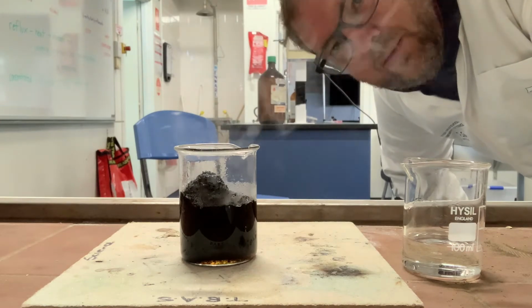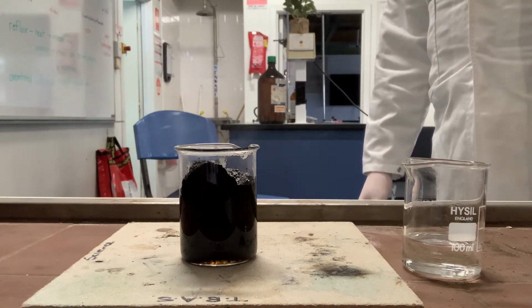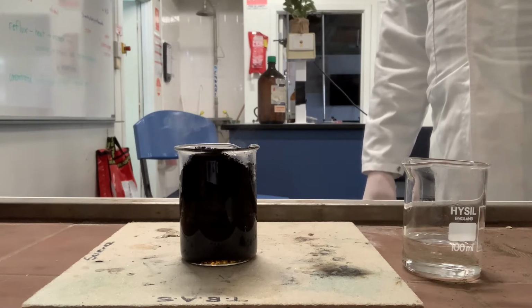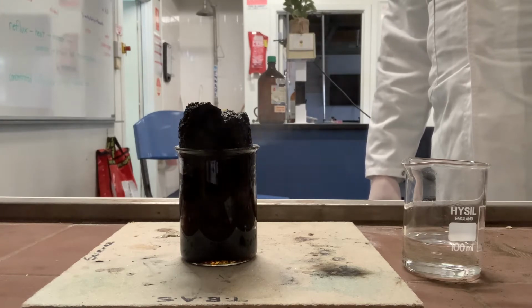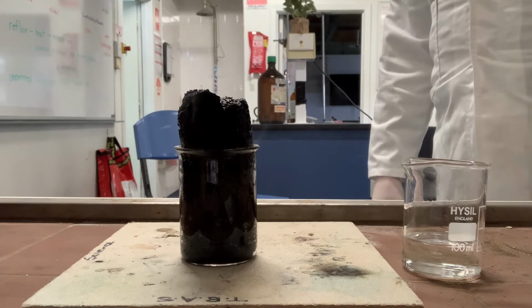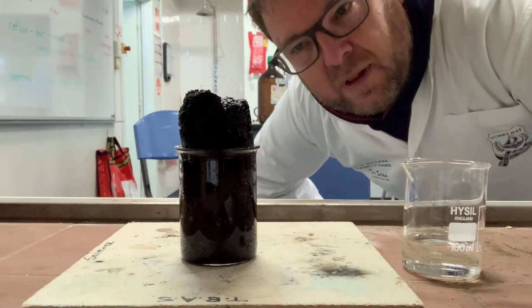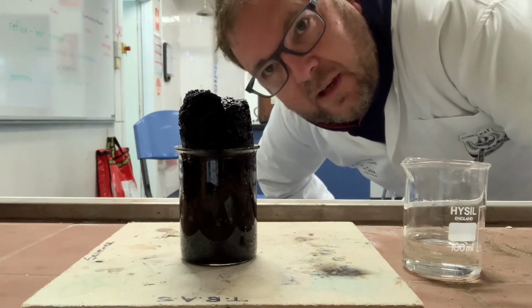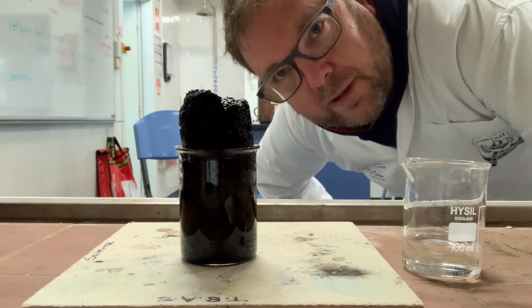Your skin if you spill that concentrated sulfuric acid on. Good news is you've got, you know, about a few minutes to rinse it off before things turn really bad. Okay, I think you get the idea of what's happened there. That is basically just one black charred carbon mess. Might go a little bit higher, but I want to keep going with this prep, so I'm not going to let the video keep running any longer. Anyway, that's the dangers of concentrated sulfuric acid.